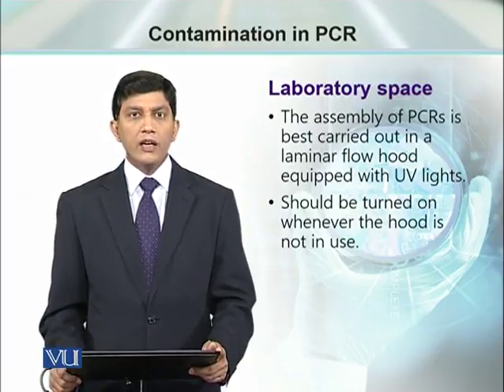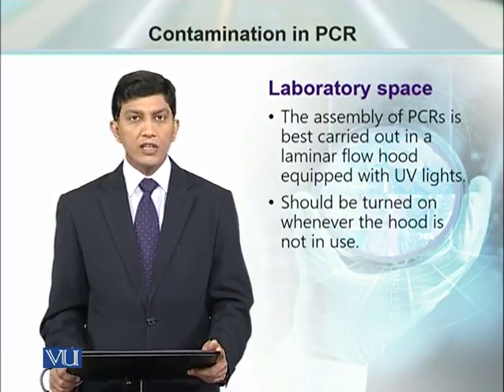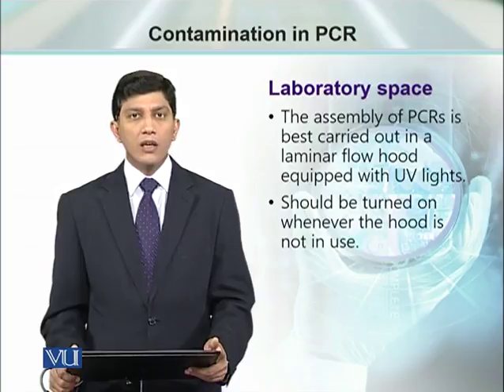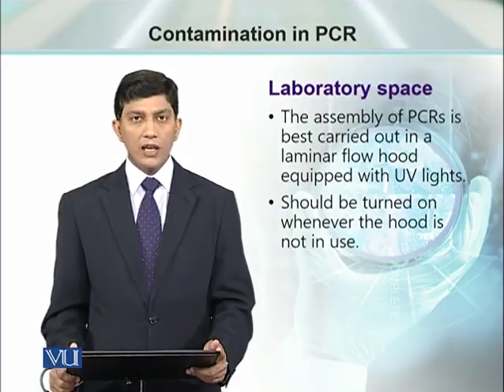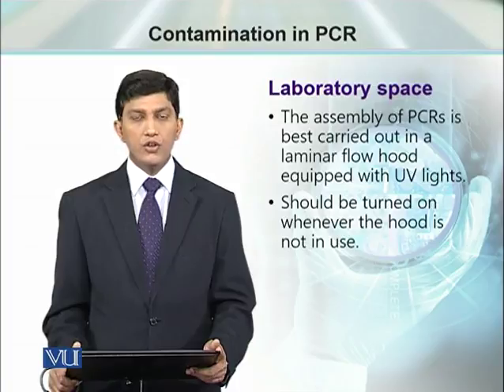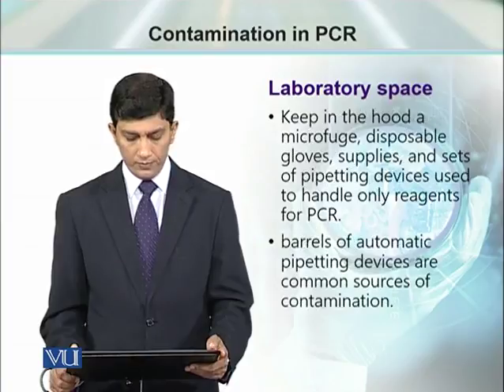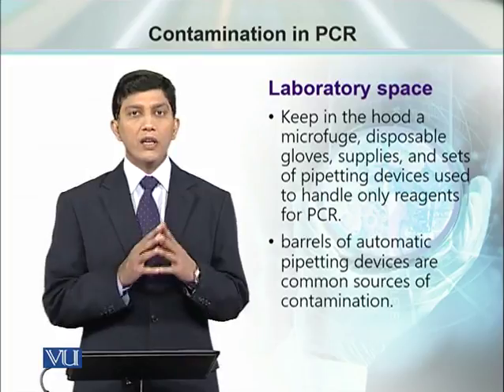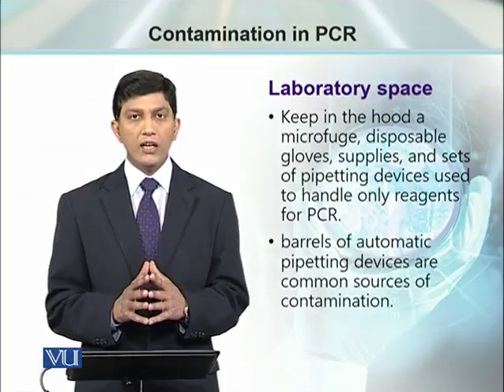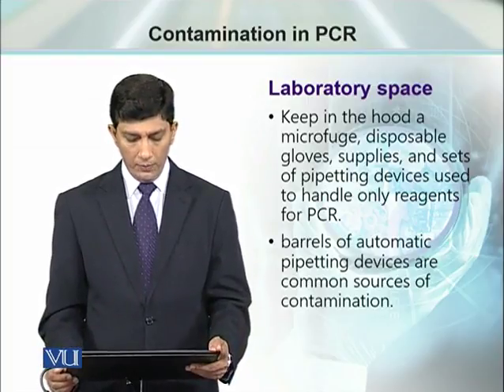It is further added that use of laminar flow to set up or prepare for PCR is good to avoid contaminations. Before using the laminar flow, you can switch on the UV lights or UV tubes so as to decontaminate the hood and area. All your supplies should be present in that hood so that they are decontaminated in the presence of UV.